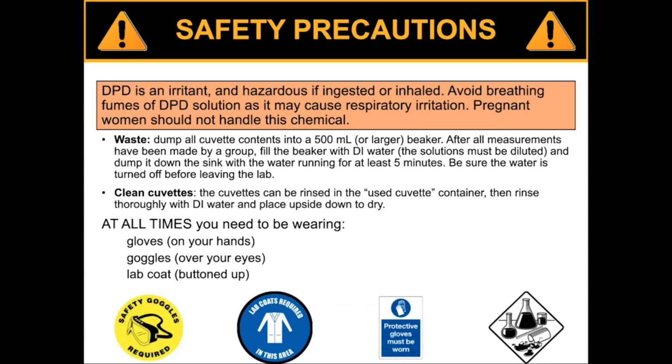Otherwise, all of the waste is going to go into a large beaker. We're going to just rinse that down the sink and let the water run, and then the clean cuvettes can be rinsed and just put in the used cuvette container. And we don't want to rinse them with alcohol, which you'll see. We're wearing gloves, goggles, and a lab coat as normal, and then you're going to see us dispose the waste, but you won't see us actually run the sink because you're not going to have to do that.